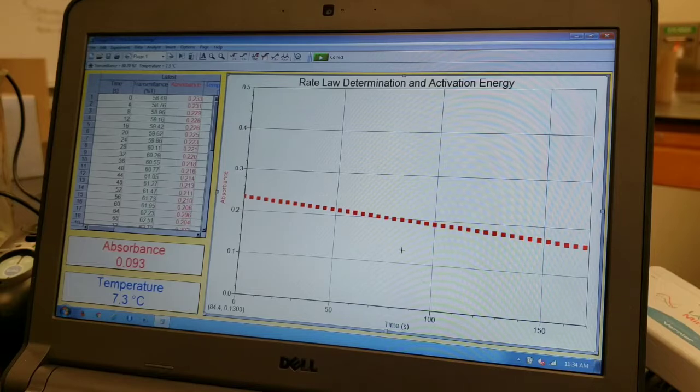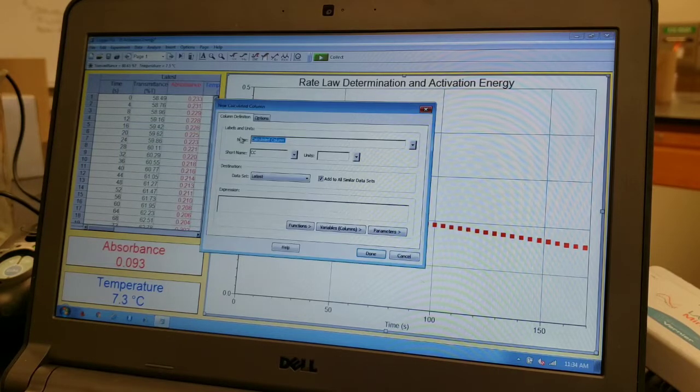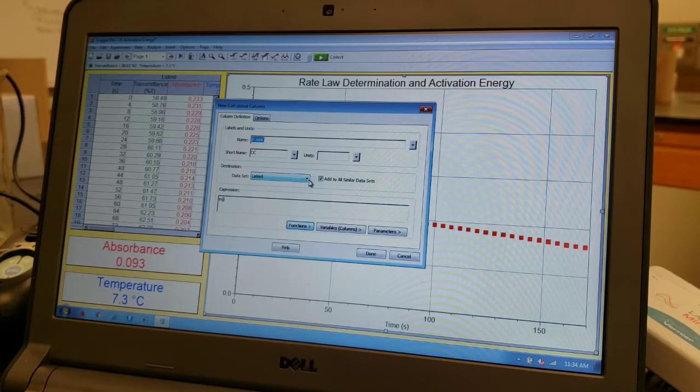Rather than download this information and analyze it, we're going to allow Logger Pro to do the work for us. So I'm going to go to Data, New Calculated Column. I'm going to call this column LN abs. This will be the natural log of the absorbance. I'm going to click in the expression, pick out function, go to ln for the natural log, and then in my variables, I'm going to pick absorbance. Done.